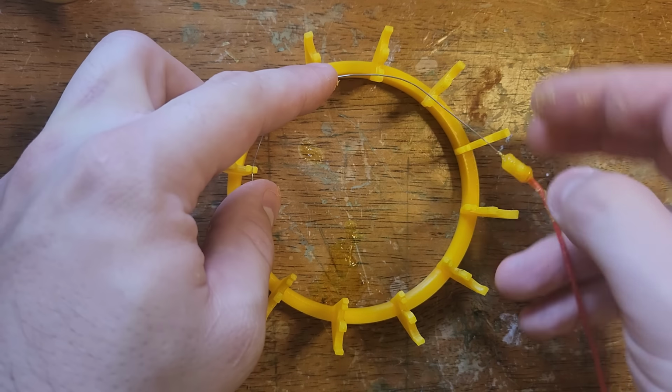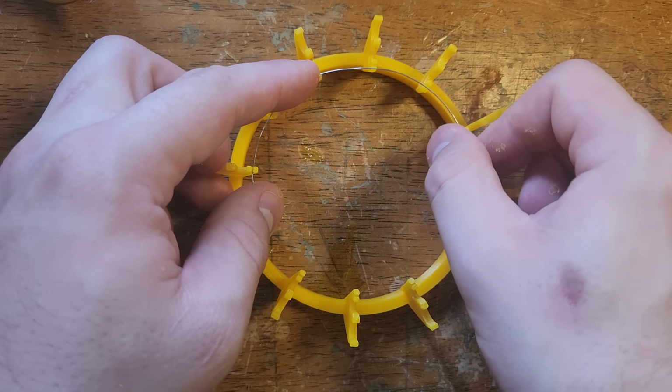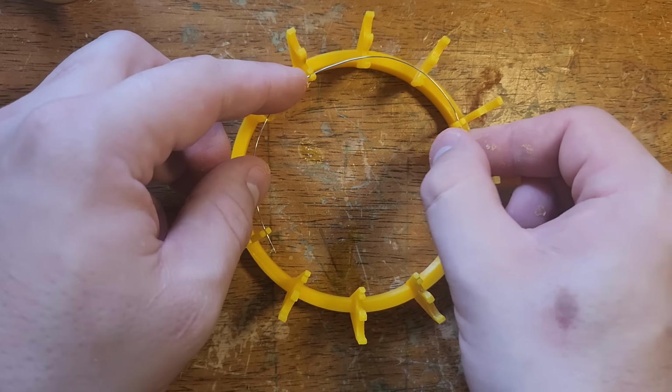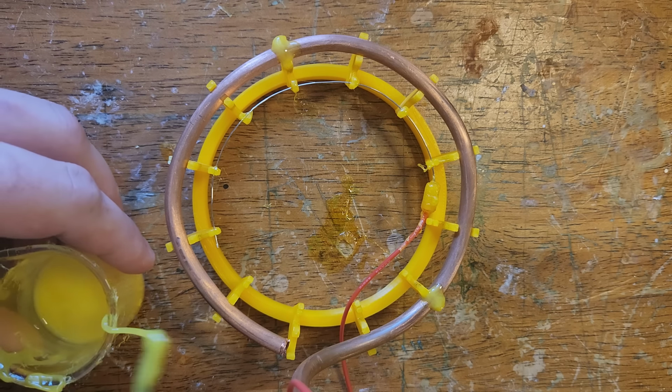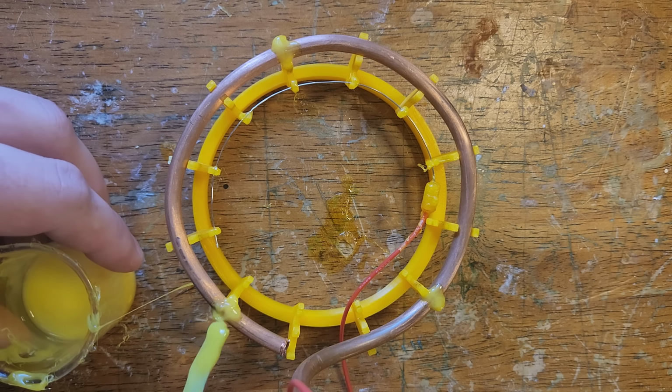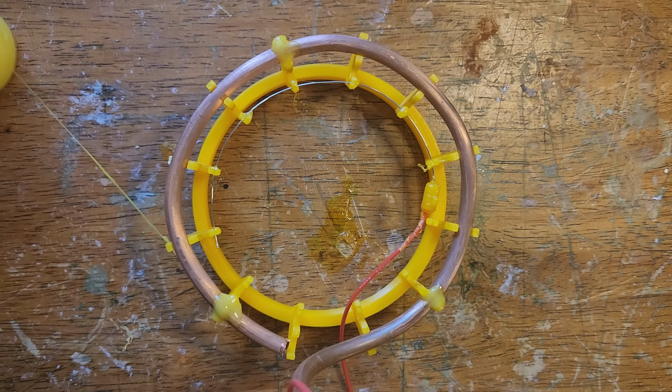Both electrodes will be mounted concentric to each other on this ABS ring with the glass bell between them. I used my ABS putty again, this time to secure the electrodes because I wasn't sure if regular glue would hold up to the harsh chemical environment. Once the anode is in place, the cathode is inserted and also tacked down with some ABS putty.